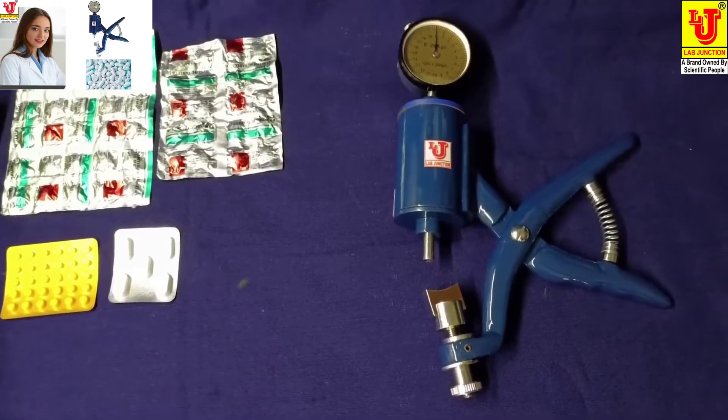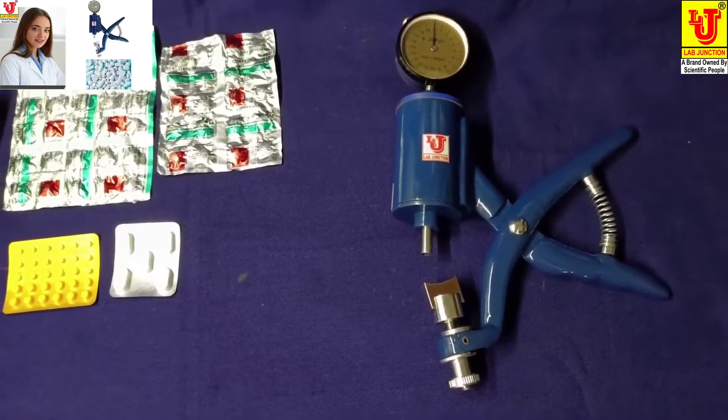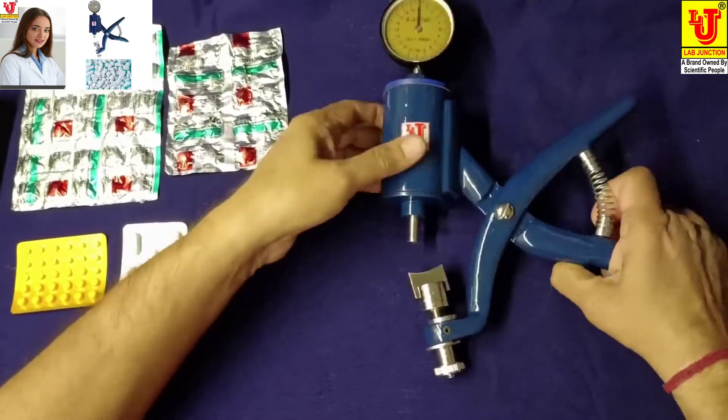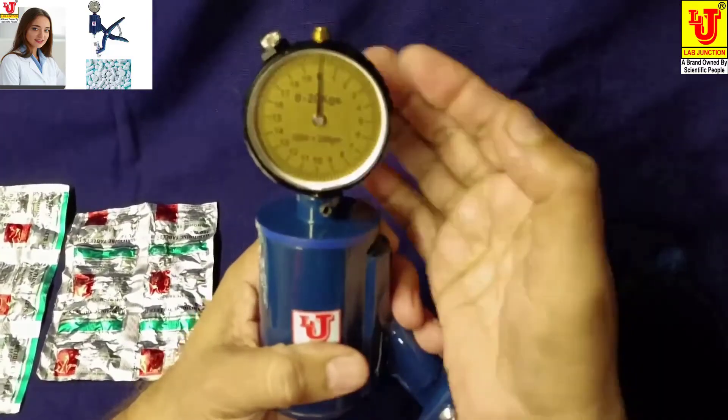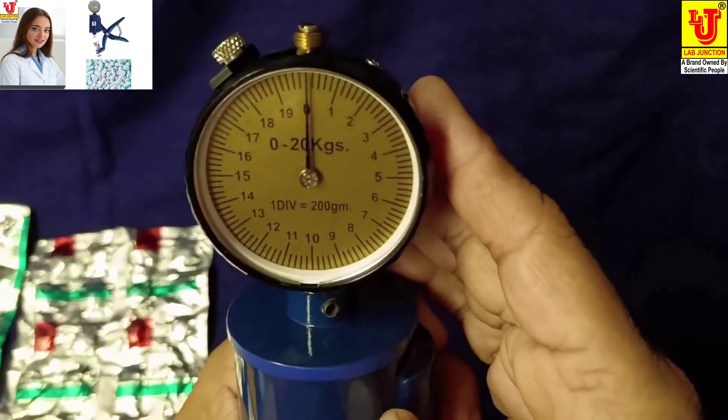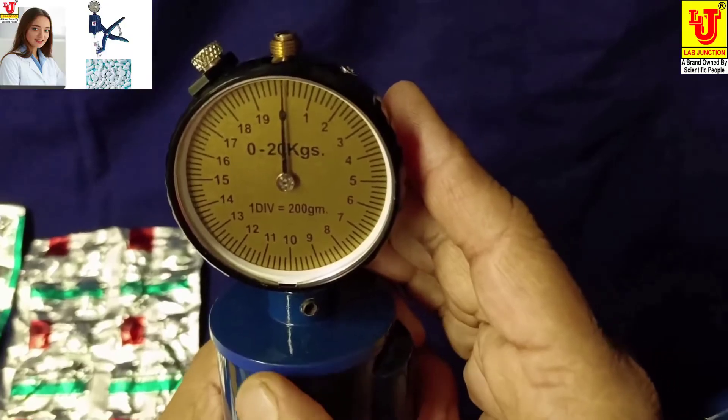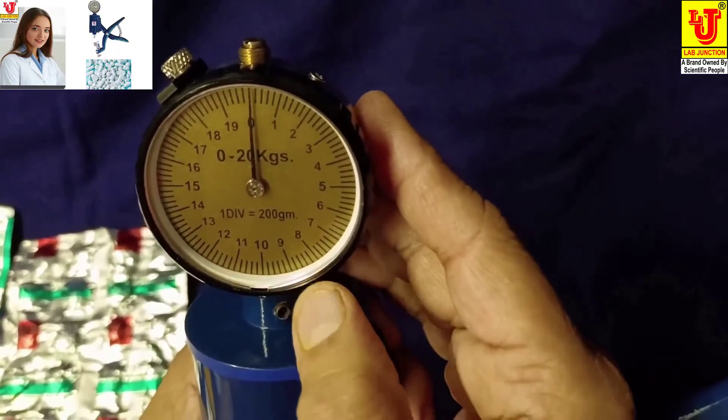The scale is adjustable for zero setting as per tablet size. This is the main scale, 0 to 20 kg. One division is equal to 200 grams.